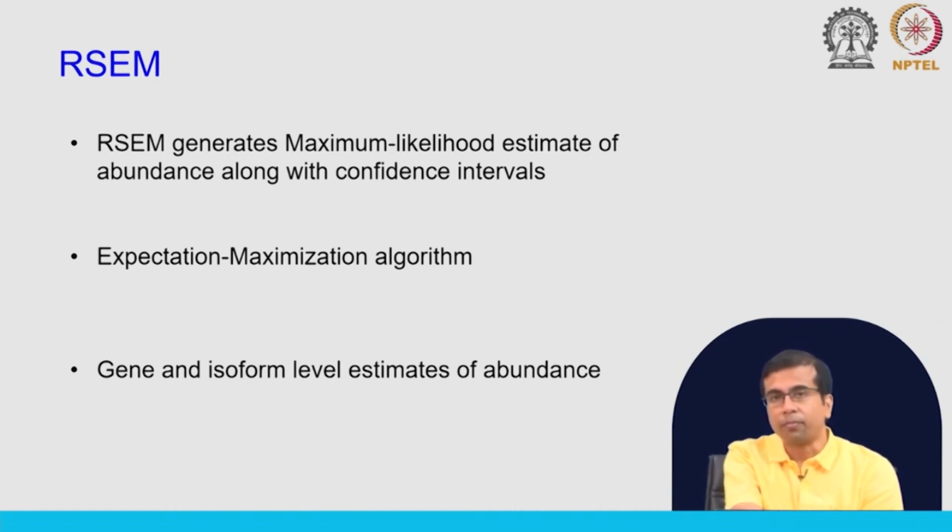Okay. So, now we are going to discuss some of the alignment free methods that are out there. What we have discussed so far, most of these methods require some sort of alignment against a reference transcript or a reference genome for quantification.